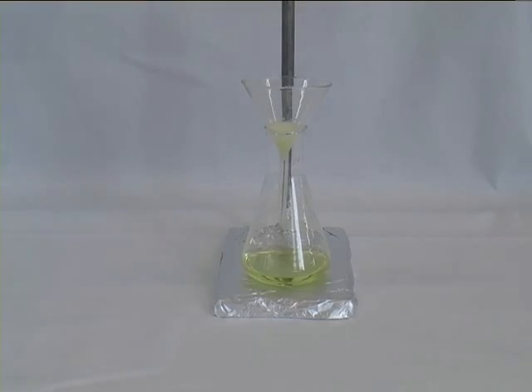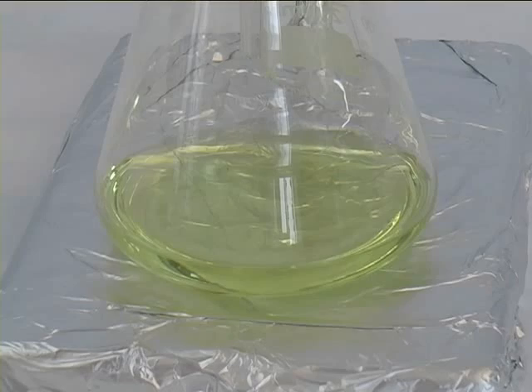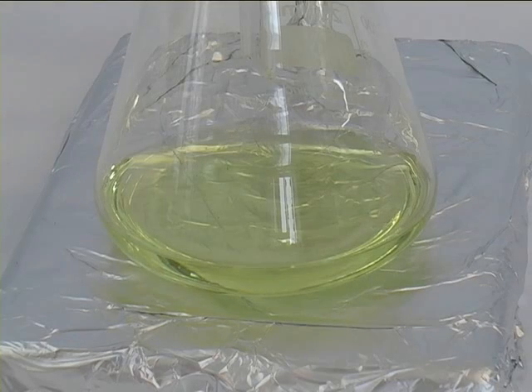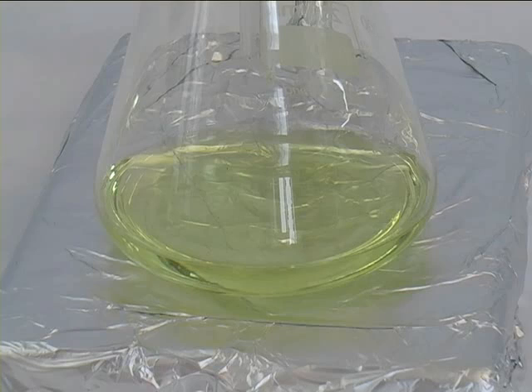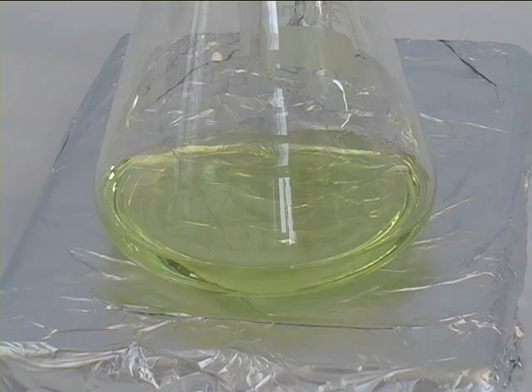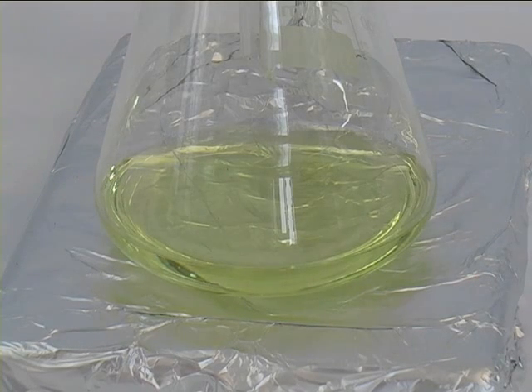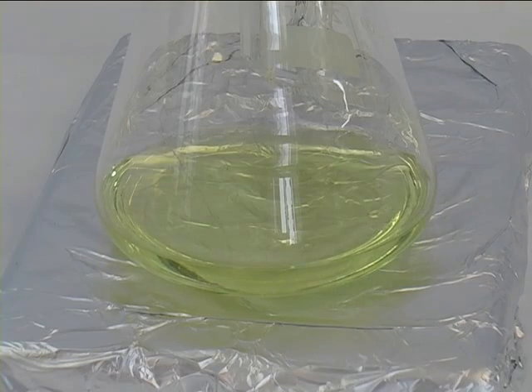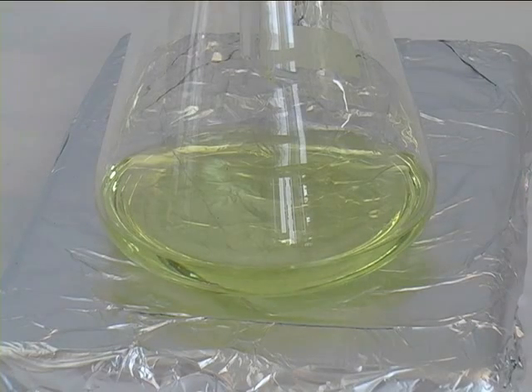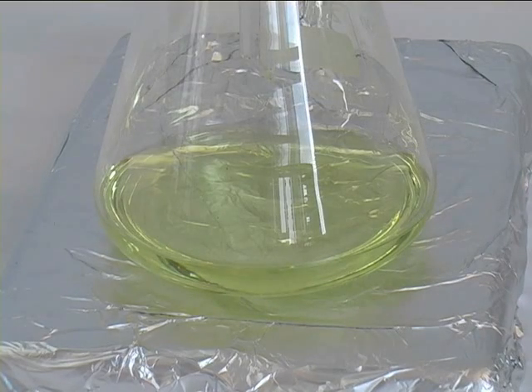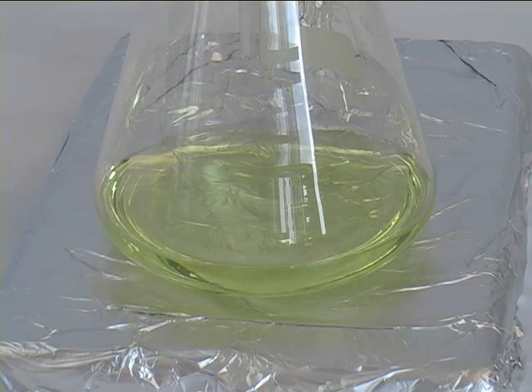To summarize, in this solvent extraction part of that experiment you use the differential solvating power of two immiscible solvents to extract and purify a solute, and you ended up after filtration with a clear dry solution of your solutes in an organic solvent.